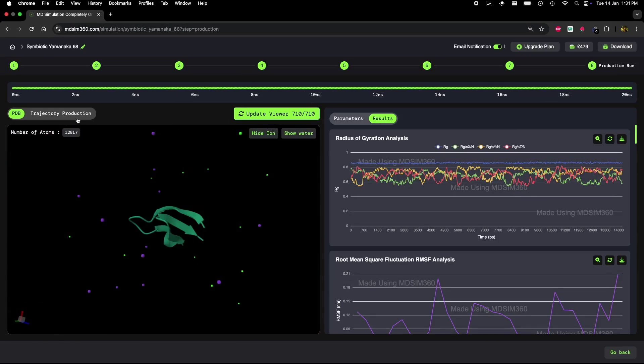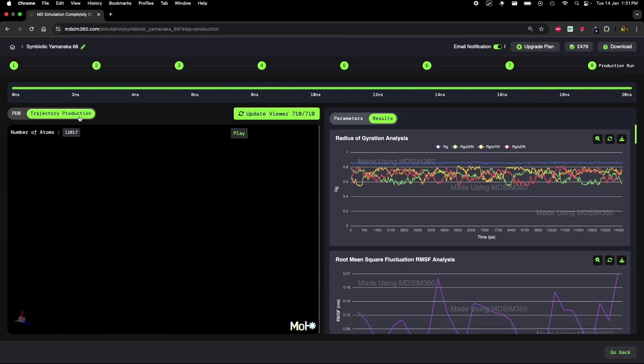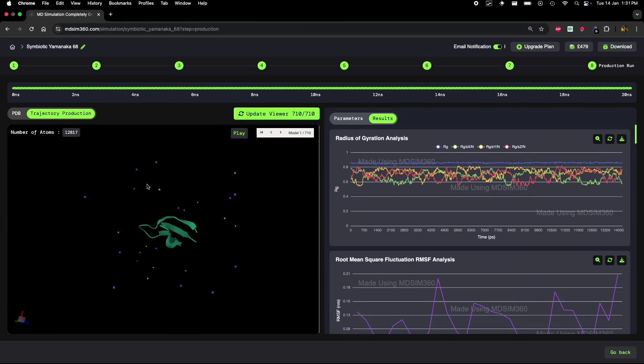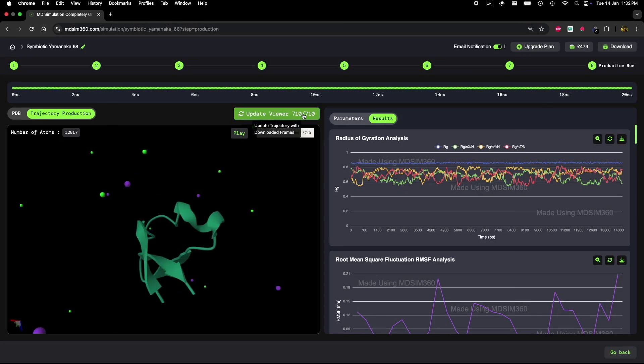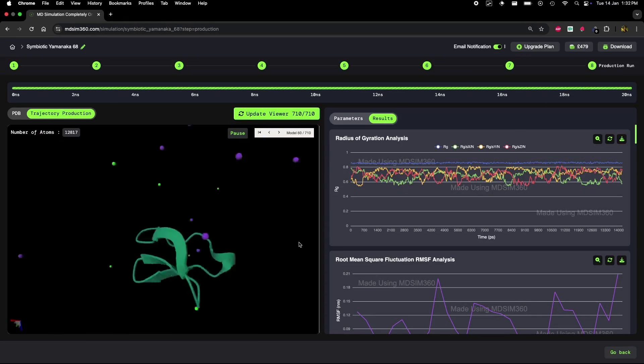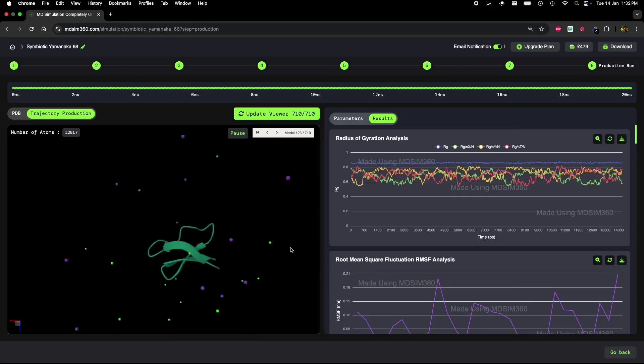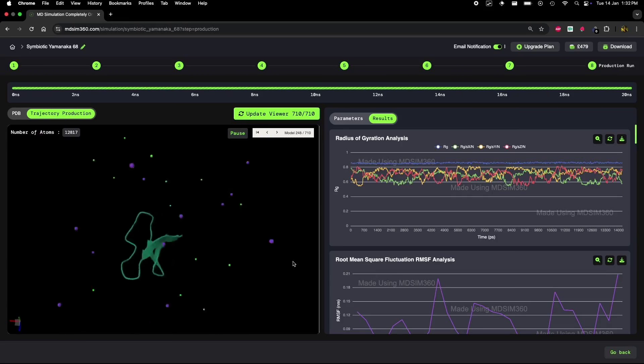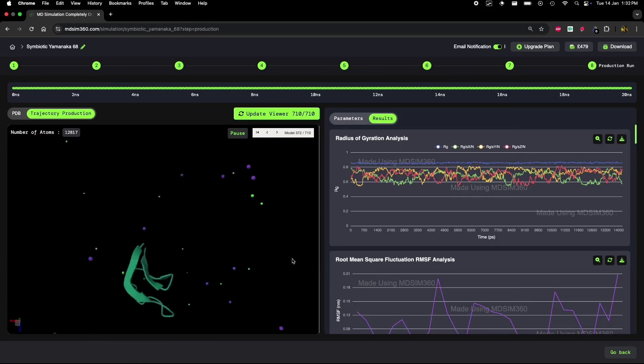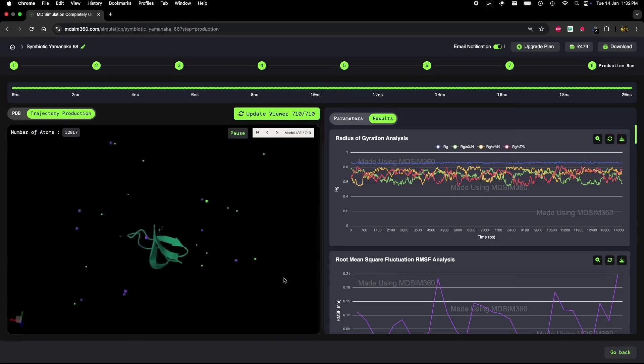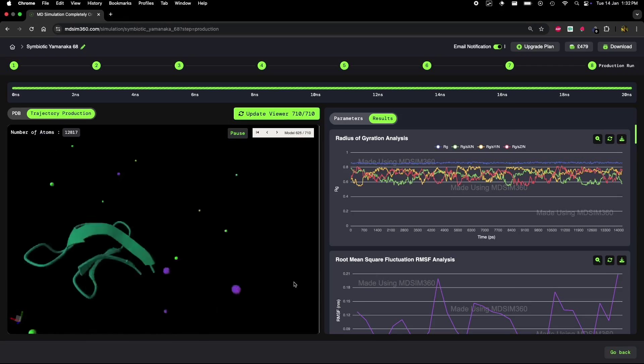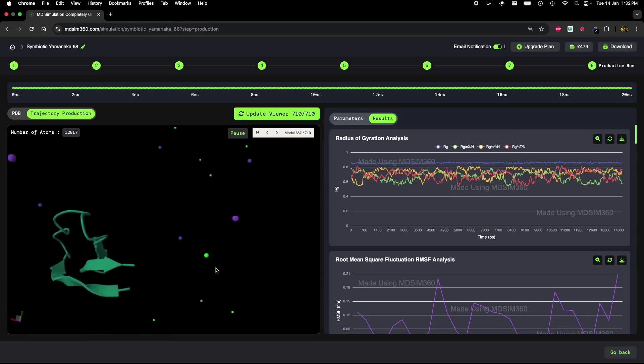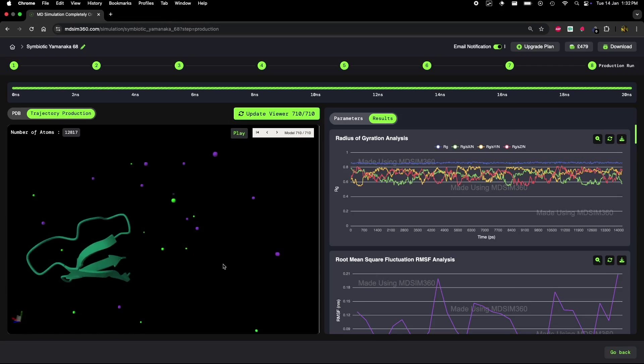The protein in this case is relatively small, with around 13,000 atoms in total, including the solvent and ions. I'll start by showing you the trajectory video of the protein. Pay close attention to any changes that might happen during the simulation.